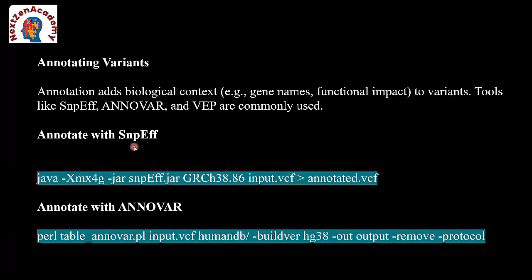It is newly developed, and it is helpful to run variant calling for single results. Here is a command, like what I already told.